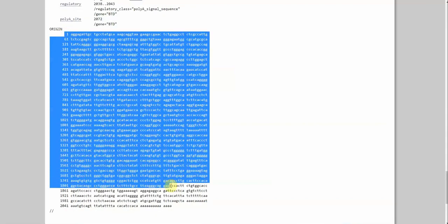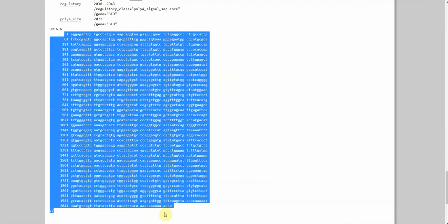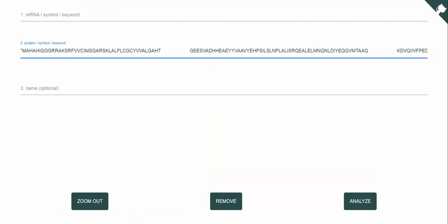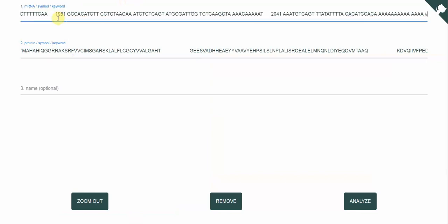And I will do the same for the mRNA sequence. There is no way of not getting these numbers anyway. So don't worry about getting them. I just highlighted this sequence and then copied and now I'm going to paste it in the mRNA input.